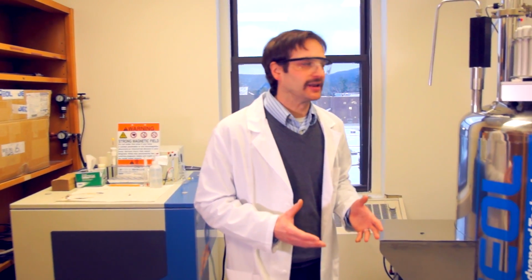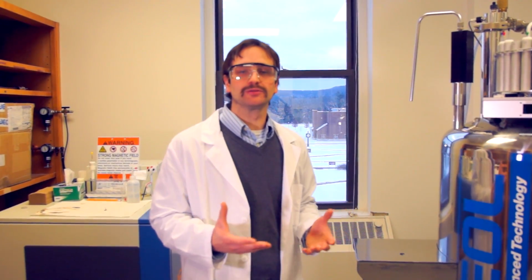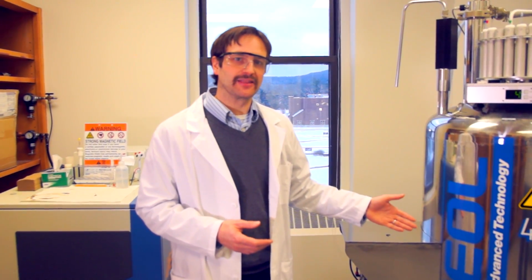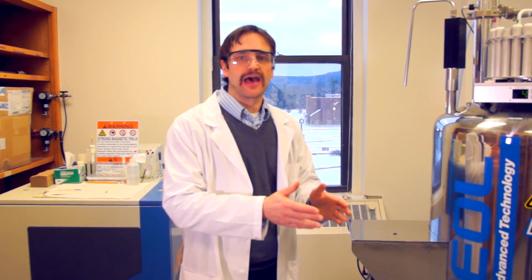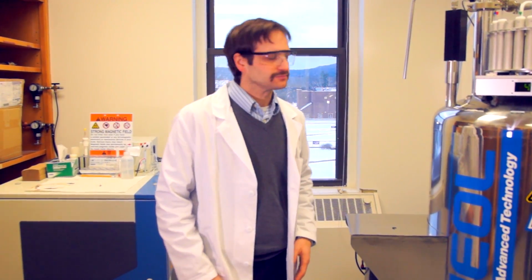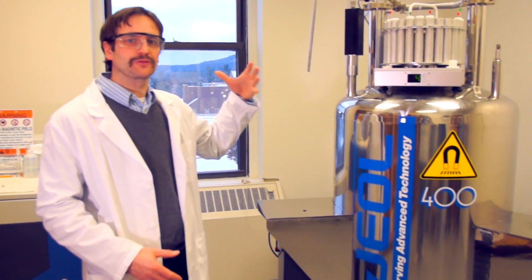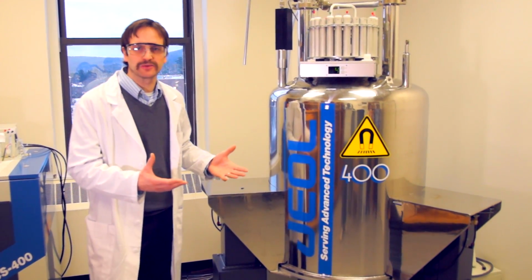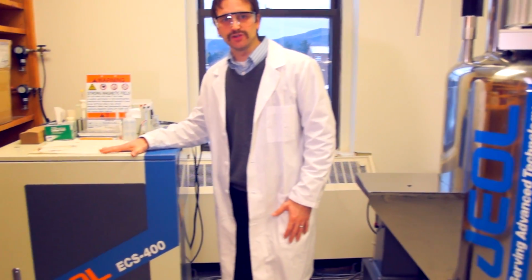So the principle behind NMR is that you take a sample with an organic molecule, something with, let's say, hydrogens on it. You put that sample inside of the magnet, inside the constant magnetic field, and then you pulse that with radio frequency. The radio frequency comes from a probe, and the parameters associated with that frequency ultimately come from the spectrometer unit over here.